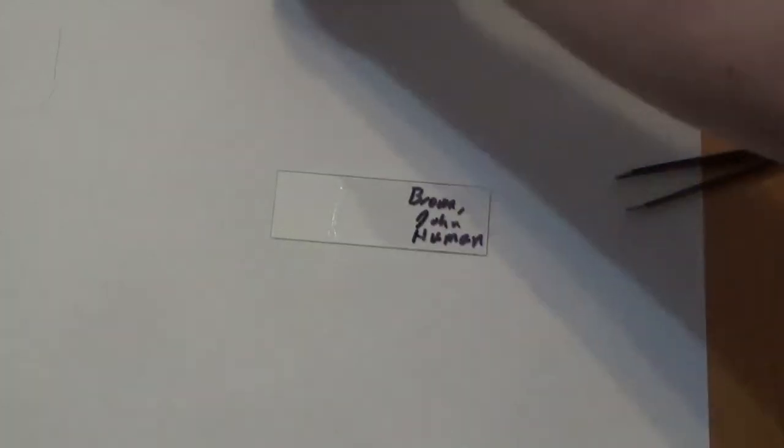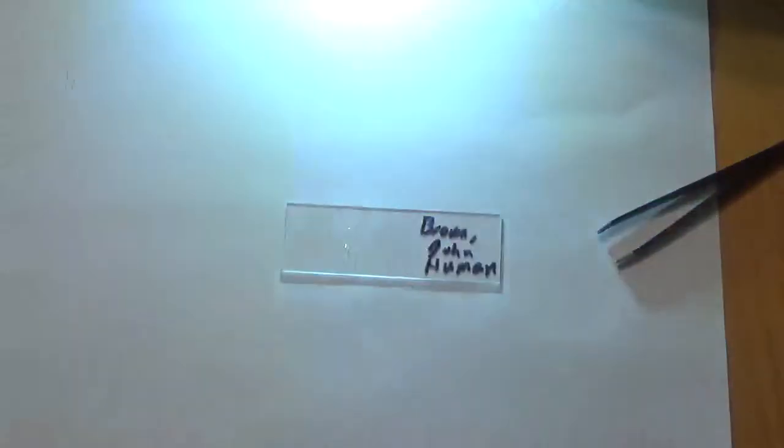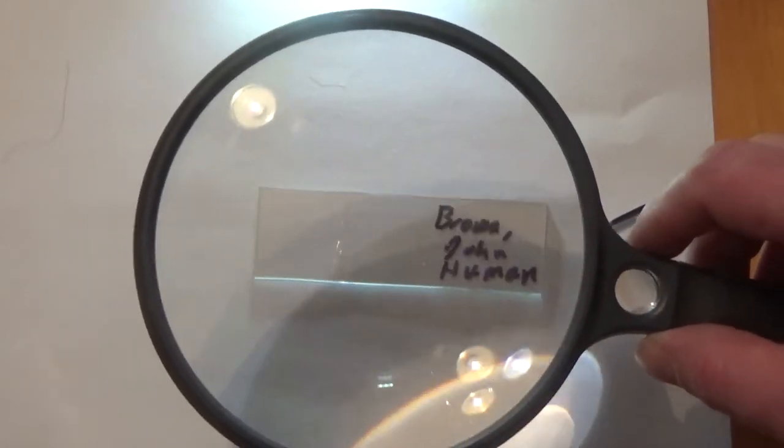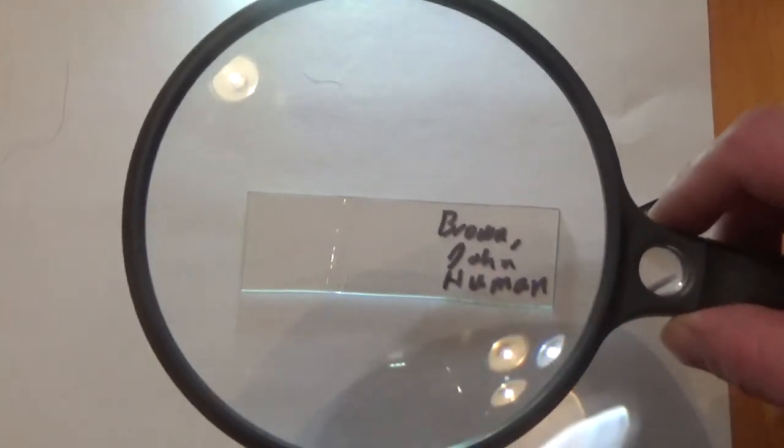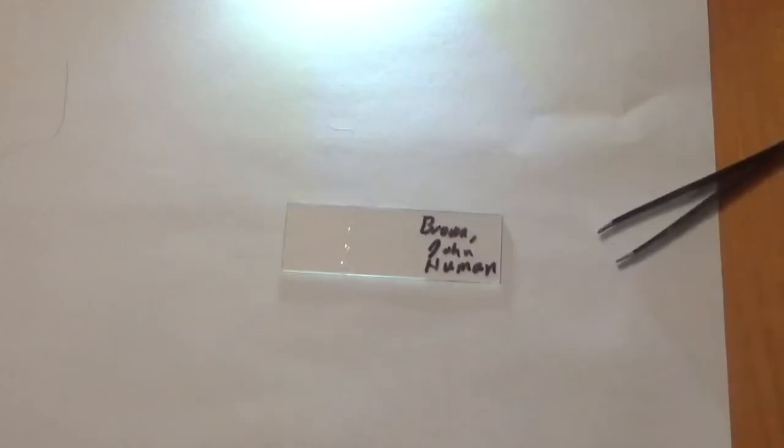I'm using oblique lighting. So at a low angle, the light is held. And you can see that line in the very center of the nail polish impression. The dried nail polish, there's an impression left. Like a footprint in the sand.